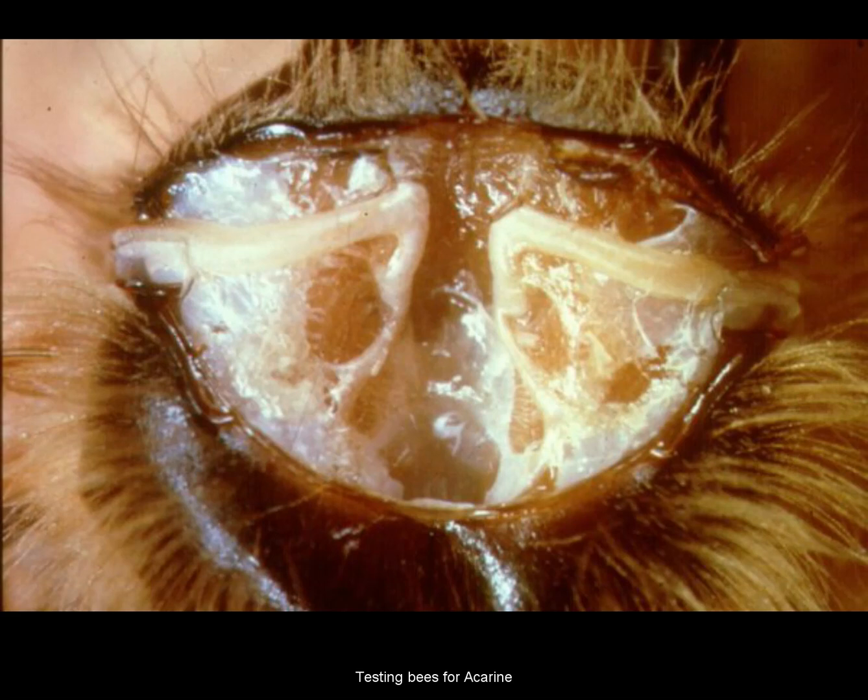I'm going to bring it around now to 40x magnification just so that you can see what it is we're looking for. We're looking at the white trachea there, and that white trachea should be white all the way across. In this picture here, it's white across from the spiracle right across the trachea on both the left and right hand side, and these are the first pair of breathing tubes in the bee.